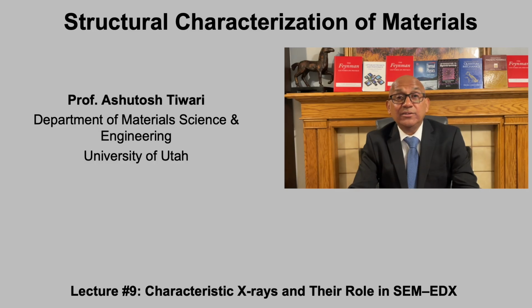This brings together the ideas developed over the last few lectures, linking electron scattering, energy loss, and signal generation to the X-ray signals used for materials identification and analysis in SEM.